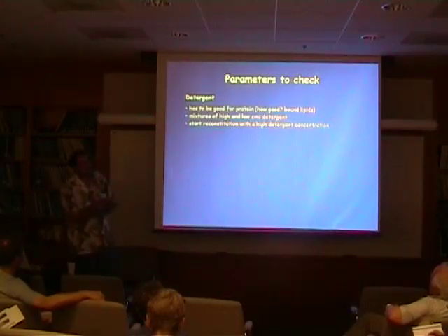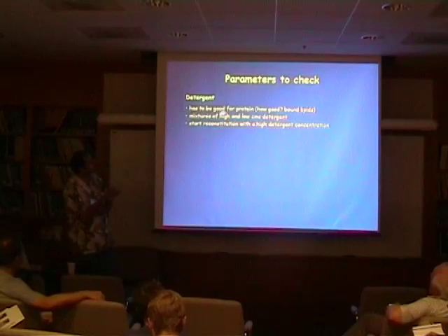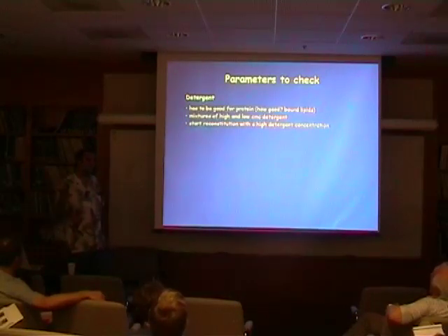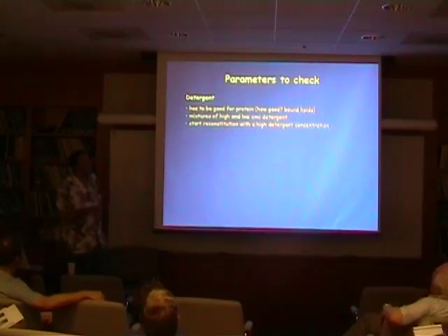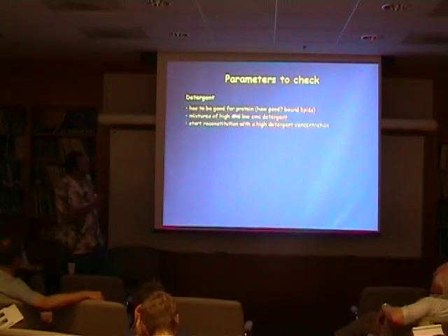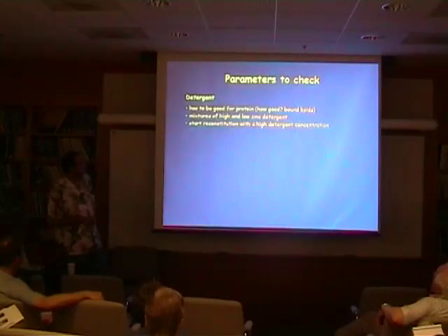So the detergent is obviously a very important factor, and a lot of people feel that it has to be really, really good, the protein has to be really happy in it, it has to be stable for several weeks, so it's a good detergent. I happen not to believe that. I want to keep the protein happy until we give them again new lipids. And so this is clearly something that my group doesn't agree with me. And so also detergents, if you have very strong ones, you can completely delipidate it. And that's actually a problem because some proteins need the lipid. So the detergent is obviously, the way it treats the protein is very important.